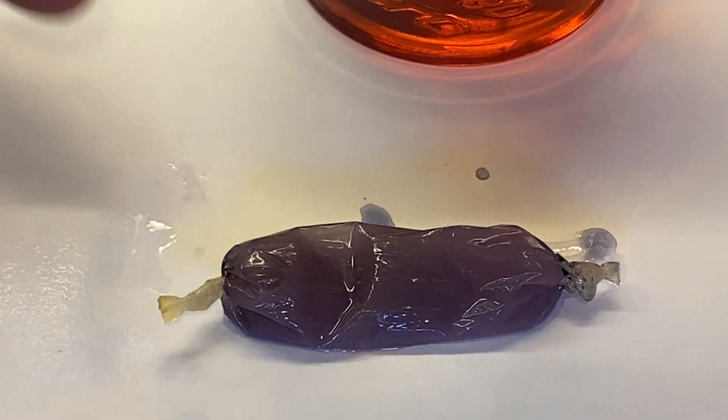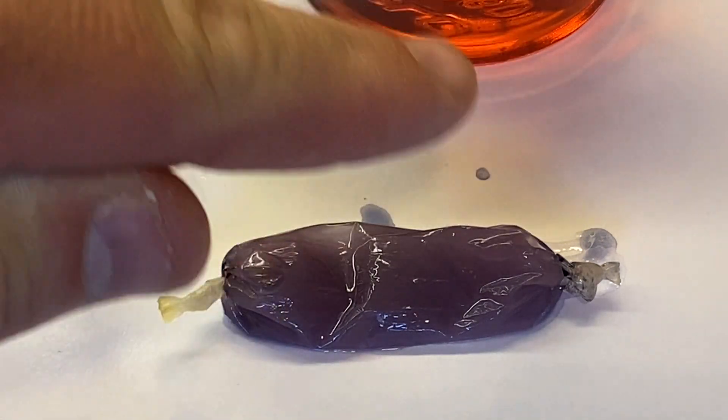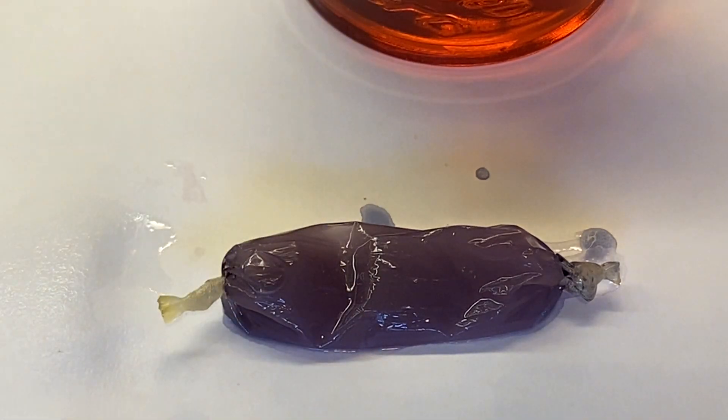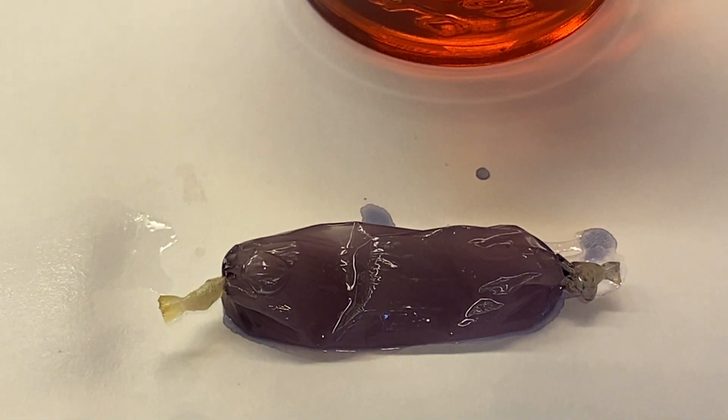However, now the iodine that was in this cup has gone into the cell because the cell is semi-permeable. The Lugol's solution, or the iodine, is very small. It's a very small molecule, so it's able to go through the membrane and into the cell.